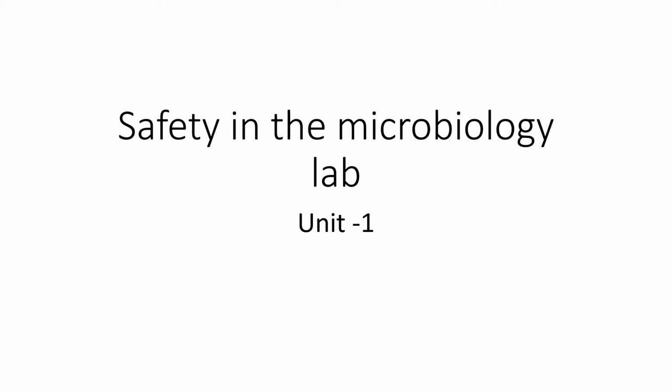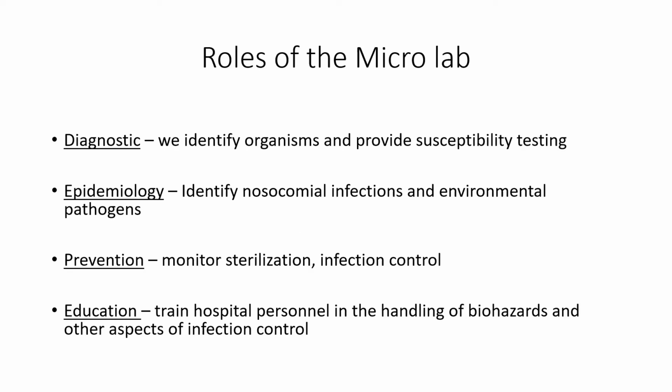We're going to talk about a lot of great things this semester, and let's go ahead and start with Unit 1, which is safety in the microbiology laboratory. There are many roles that the microbiologist plays when they are working in a microbiology laboratory. One such role is called the diagnostic role, where we identify organisms and provide susceptibility testing. That's probably one of the most important things that we do in a microbiology lab.